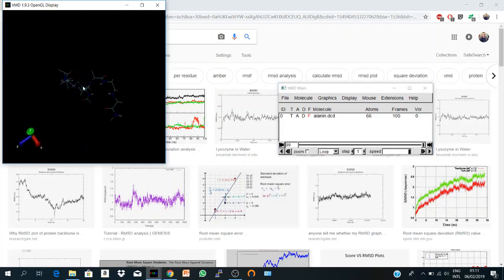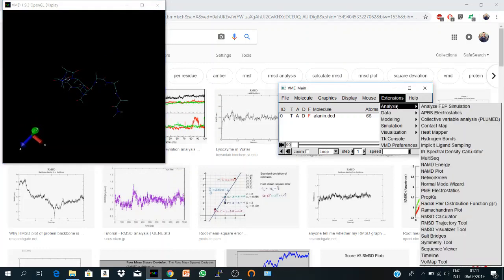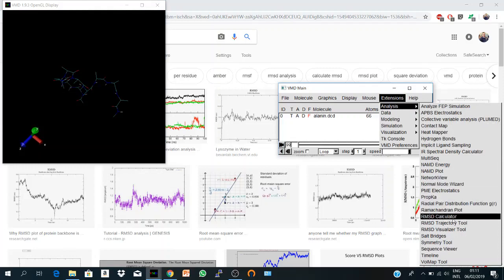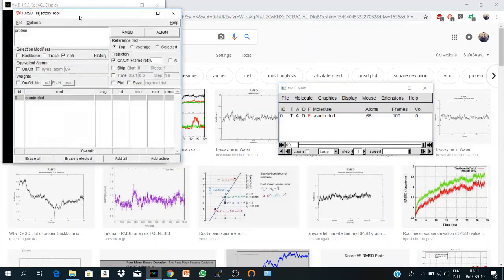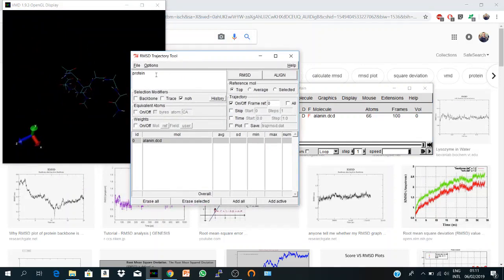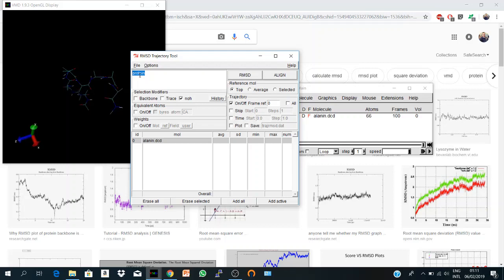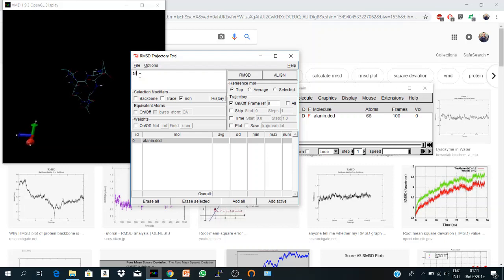Then you go to Extensions, Analysis, and RMSD Trajectory Tool. Here is your selection. Now it's protein. It could be all, so you calculate for all the atoms or for everything in the structure.